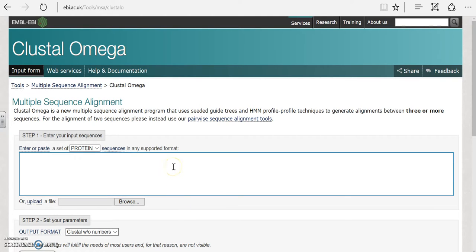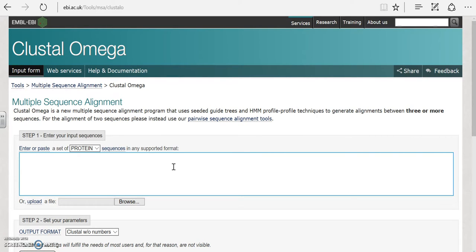What we're going to do is take our five species that we just compared in the previous exercise and we are going to use Clustal Omega to compare them visually. In our first step we are going to input our sequences.